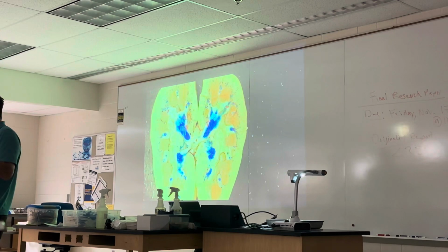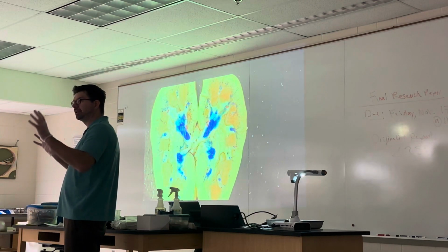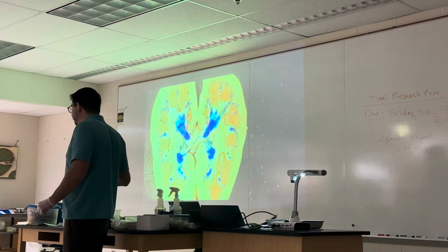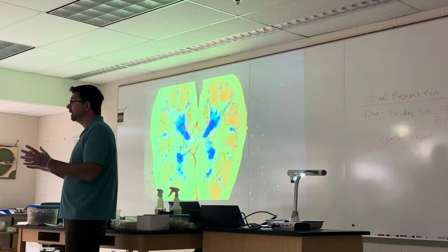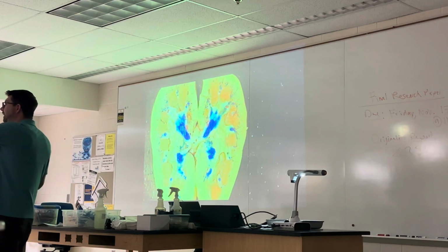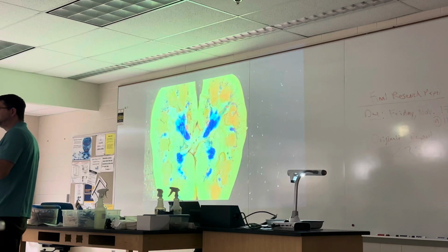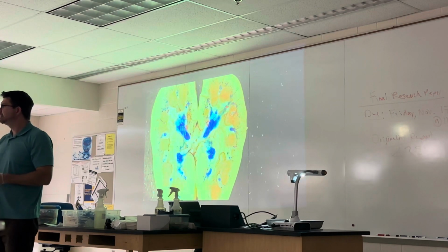And again, if you do dissect the pig kidney, remember, of course, when you're done, your gloves get thrown in the gut barrel up front, and you want to use the disinfectant to spray down your safety glasses. And the trays, you want to make sure to use the detergent spray near the sink, and then, just like always, you want to go ahead and rinse off the trays and hang them up to dry like you see behind Alexis there.